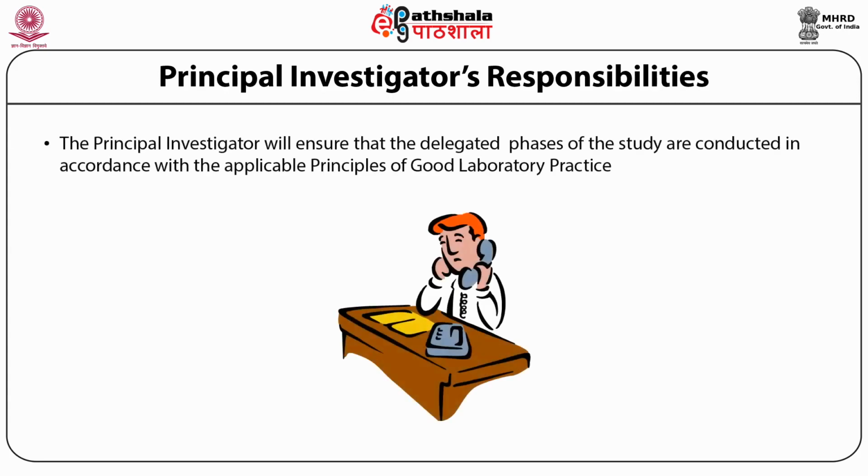Here, the principal investigator ensures that the delegated phases of the study are conducted in accordance with the applicable principles of good laboratory practices and other safety measures.